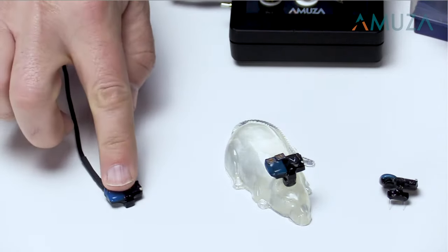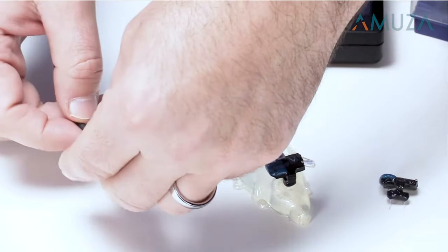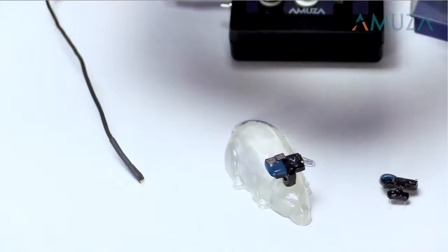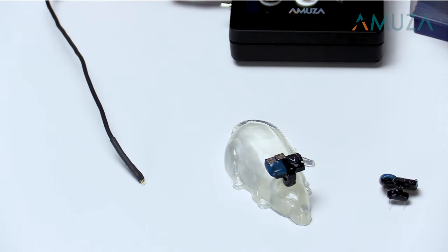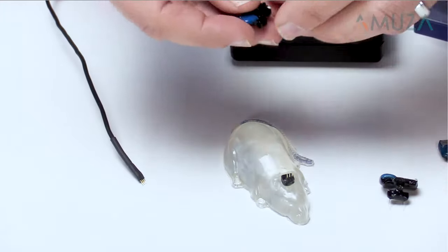Between experiments, receivers are recharged. This can take an hour or two. The battery life depends on how frequently you stimulate your mice or rats. We offer larger receivers with larger batteries for use with rats and small receivers for use with mice. It's easy to switch the receivers during an experiment, so chronic experiments lasting many days are possible.